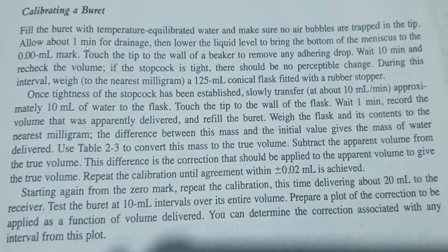Now, we have to get rid of the excess. So, of course, we have to drain the liquid or the water inside until the bottom of the meniscus is at the 0.00 ml mark. And then we have to remove excess liquids, especially at the tip of the burette, by touching it to the receiving vessel like the beaker. And then wait for 10 minutes and recheck the volume. If there is no change in the volume and it is still at the 0.00 ml mark, then it means your stopcock is already tight.